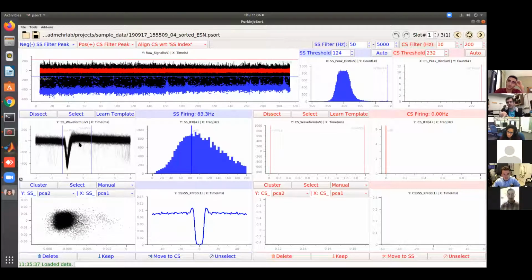We also included a sample data set that has multiple spikelets in the paper. In figure 2, we included that. And just using the template was enough to detect those things. But as I mentioned, if you are not happy with the alignment, you can definitely select those and go back and manually change the alignment.